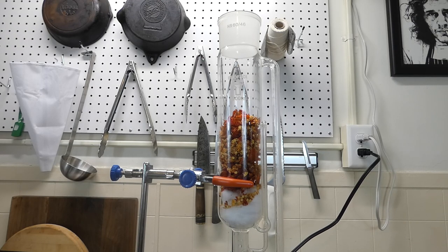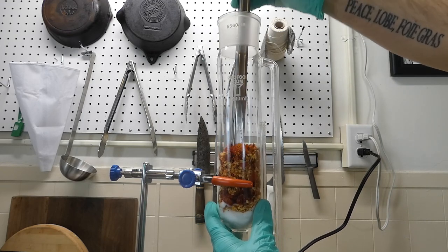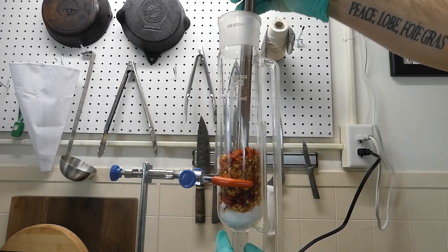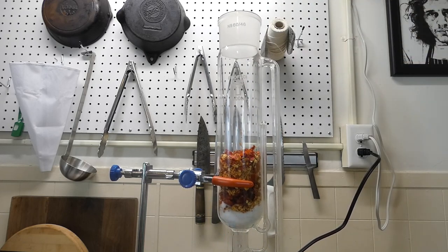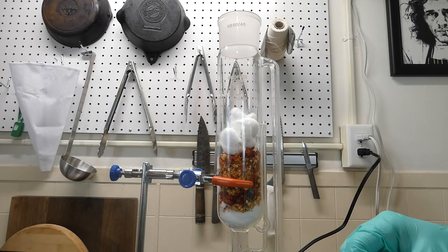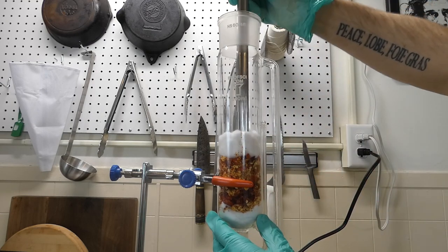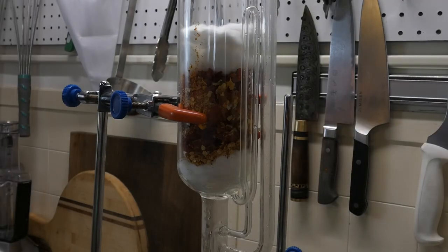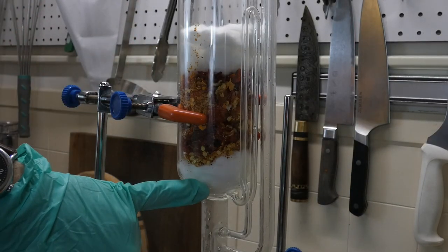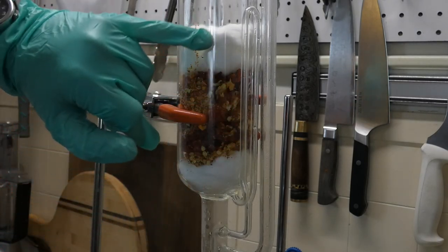And then you're just gonna take your tongs or whatever you're using to push things down again, and you're just gonna push that down lightly, making sure you're not compacting that cotton too much. And then we're going to pop some more cotton on top. You're just gonna lightly tap that down as well. This is what the setup should look like in the Soxhlet extractor. Should have cotton, your material that you're extracting, and a little more cotton.